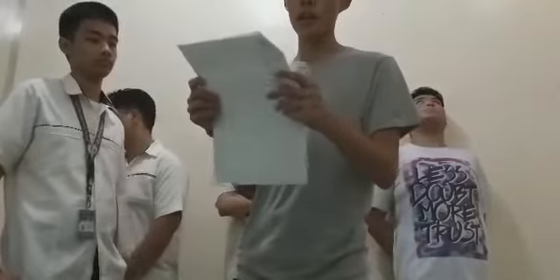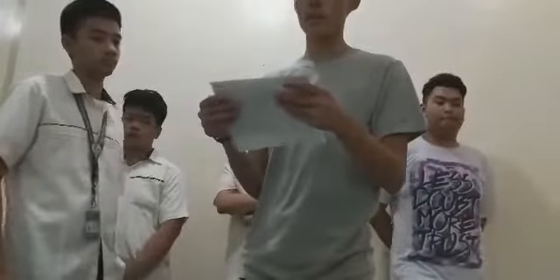I discussed the freshwater potato. The initial day 1 is 2.5 centimeters in width and 5 centimeters in length. The final day 2 is 4.7 centimeters in length and 2.5 centimeters in width. The turgidity is crisp. The tonicity is hypertonic. That concludes our gathered data, our results from our experiment.